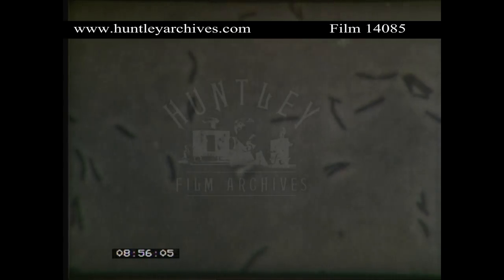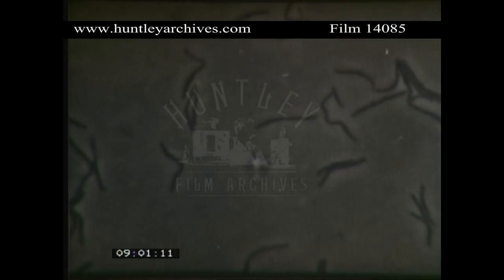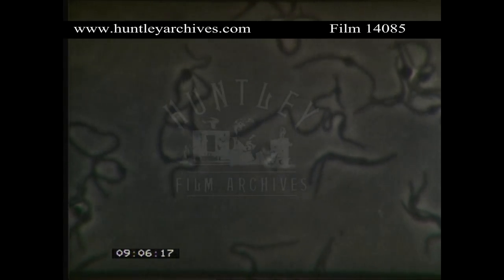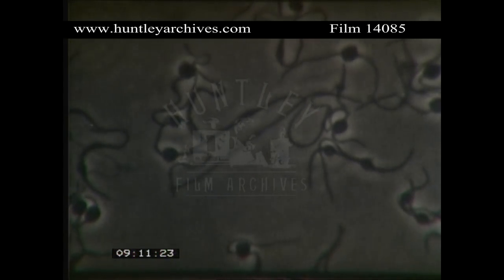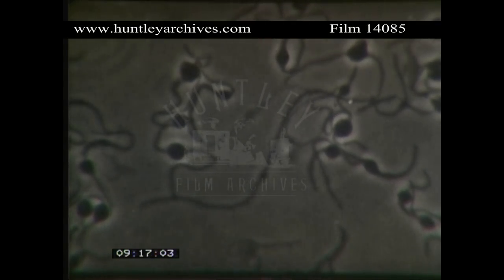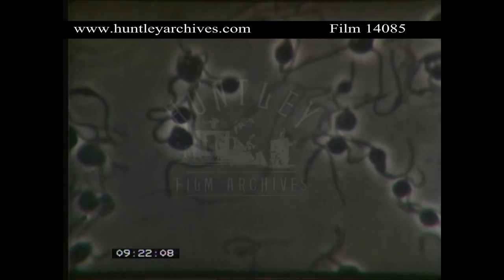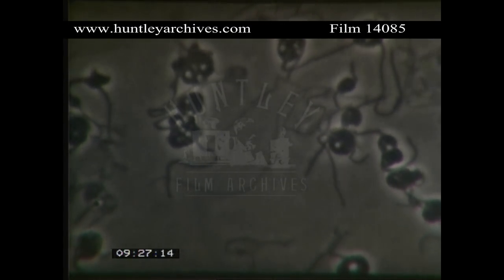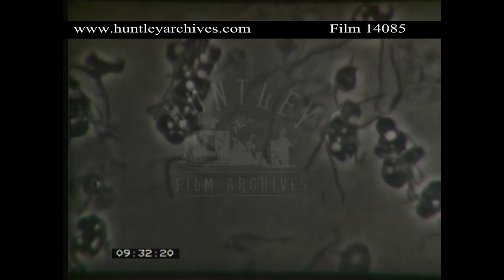Finally, here is the appearance on one half of the inhibitory dose, 5 units. The cells increase in length as before, but also weaknesses occur in the cell wall, and swellings appear which may burst, leaving only a ghost. The light areas in the swellings are vacuoles, and most of these cells are not viable.